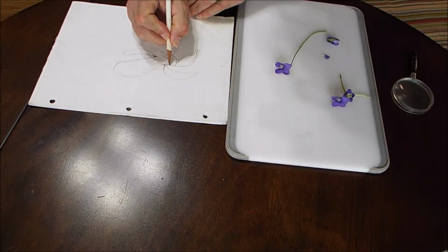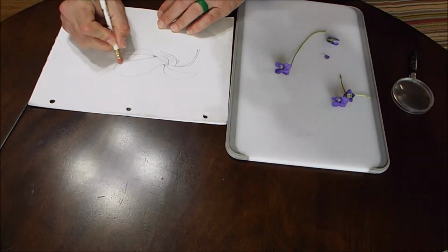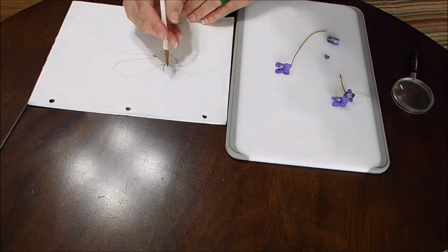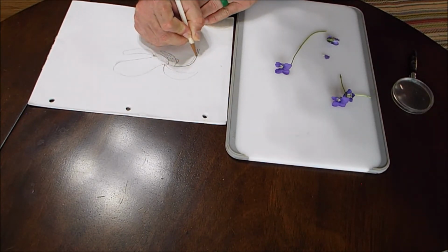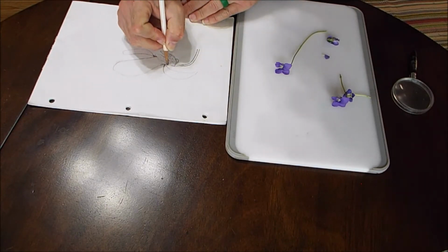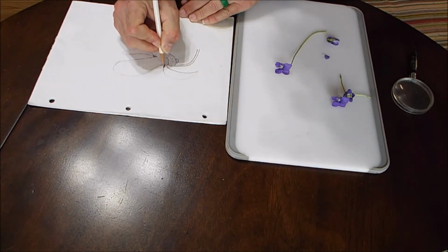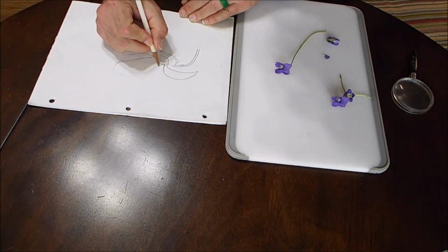Now I kind of have my lines. Let me just check them real quick. I pretty much have them where I want. I'm going to erase some of the strays and darken them in, because scientific illustration should look like a line drawing, right? A drawing made of lines, not of little itty-bitty sketch marks, which is the way I always start out.